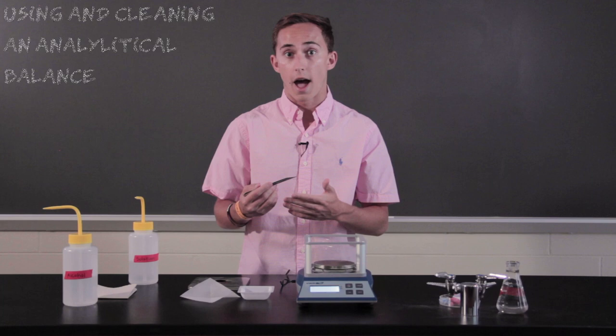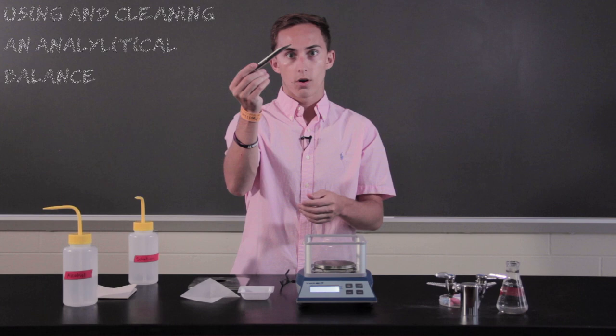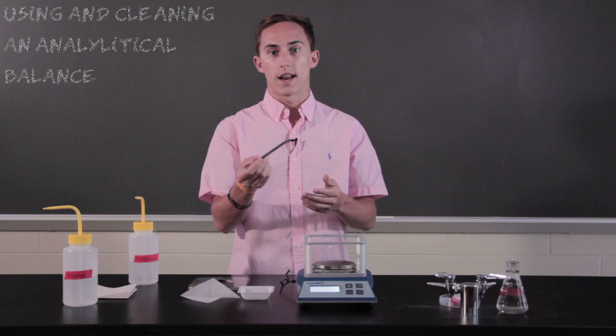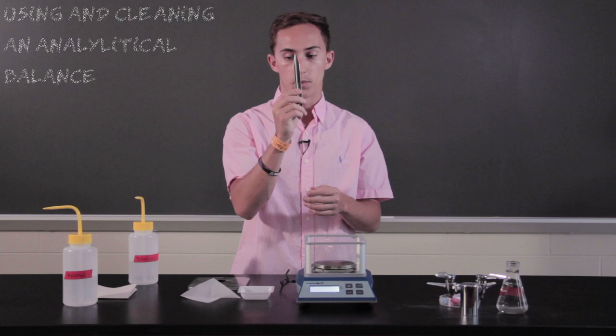Now for weigh paper, we usually use a solid or a powder type sample, and that's where your scooper will come in, because you'll go into your sample, you'll scoop it out, and you'll put it on your weigh paper, and you do however much you need. If you put too much on, you can take it out and put it back in. If you need more, you take it out, you put it on. So this is helpful for solid samples.